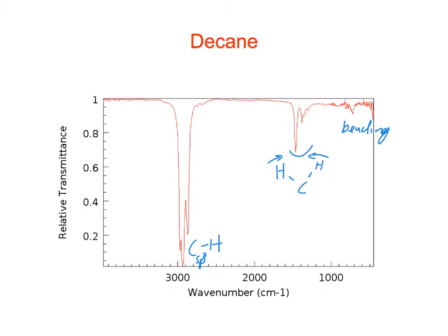Can you explain if there is a difference between KBr pellets and the diamond tip IRs? I don't know what the diamond tip is. You put the sample on the top, and you just use force, and the diamond tip crushes it. It's a solid, but it's not a KBr pellet. So it's just if you have a solid sample. Yeah, instead of mixing with KBr, you can just twist this.